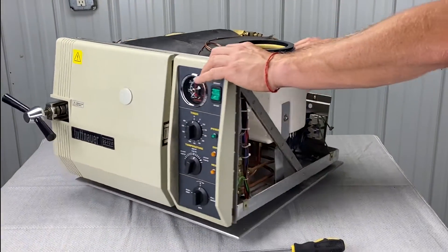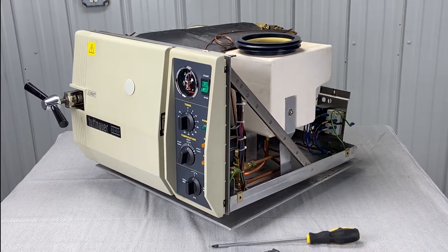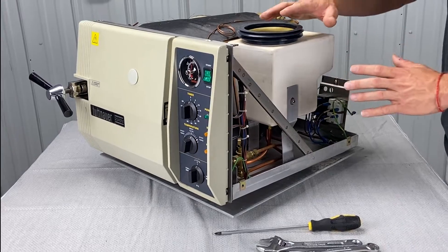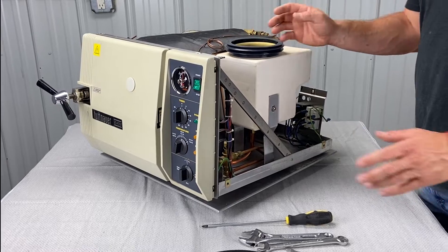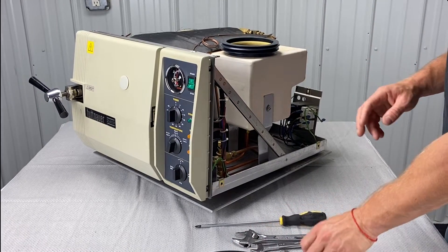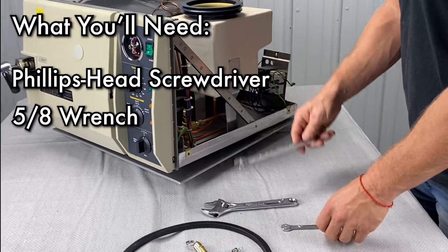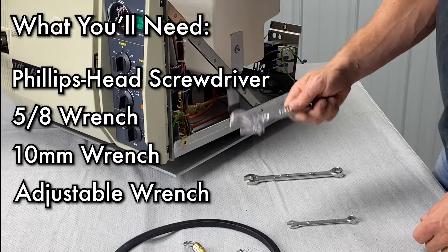Refer to our other video on how to take the cover off of the manual unit. Once you get the cover off, we can dig into replacing these parts. You're going to need a Phillips screwdriver for later, a 5/8 wrench, a 10 millimeter wrench, and an adjustable wrench.